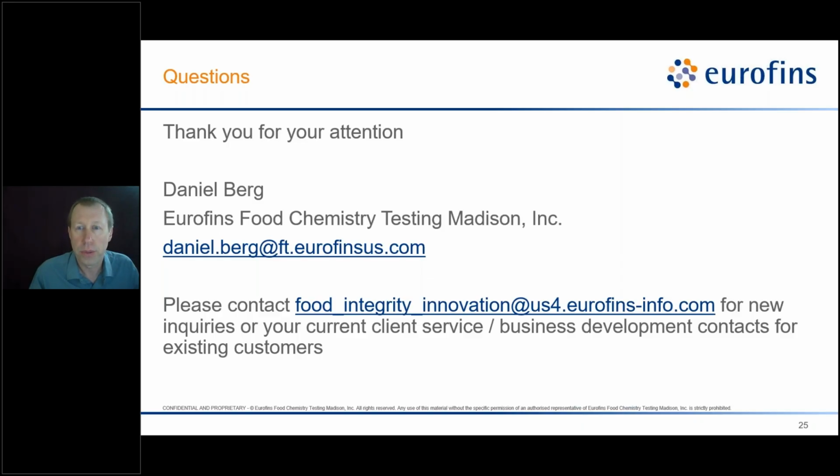Do I need to do a crude protein analysis in combination with a measurement for carnitine, for example? Do I need to do a non-protein nitrogen analysis? Or am I really looking for something very specific and I need to choose a specific method? The second way I'll answer that question is really about finding the answers, right?